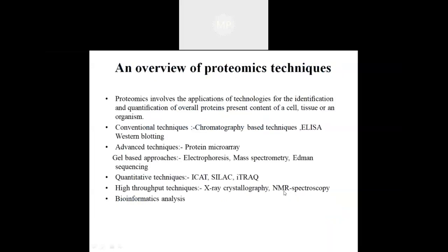This is an overview of proteomic techniques. Proteomics is the study of proteins on a large scale, or in another manner, it involves the application of techniques for the identification and quantification of overall proteins in a cell, a tissue, or an organism.